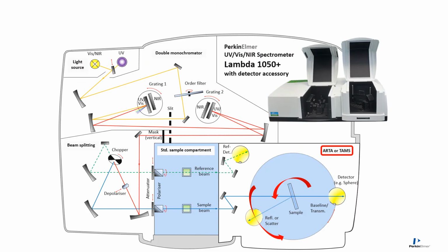So we've seen that exploiting the sample compartment in an appropriate way can lead to very accurate measurements, though this requires a lot of time and an end user who is experienced in metrology and/or analytical techniques. If we now switch back to the detector compartment area, we can now briefly explore other ways that allow for accurate measurements, but with the added automation, which then allows the end user to move on to other tasks within the lab.